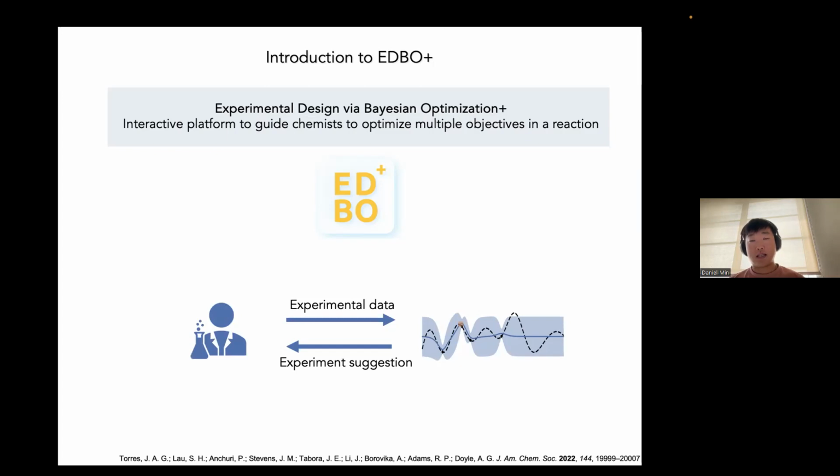Whether that means satisfactory results, so we have a good enough yield and don't have to go on anymore, or we can't proceed anymore because we already exhausted the search space, or we ran out of experiments, or convergence.